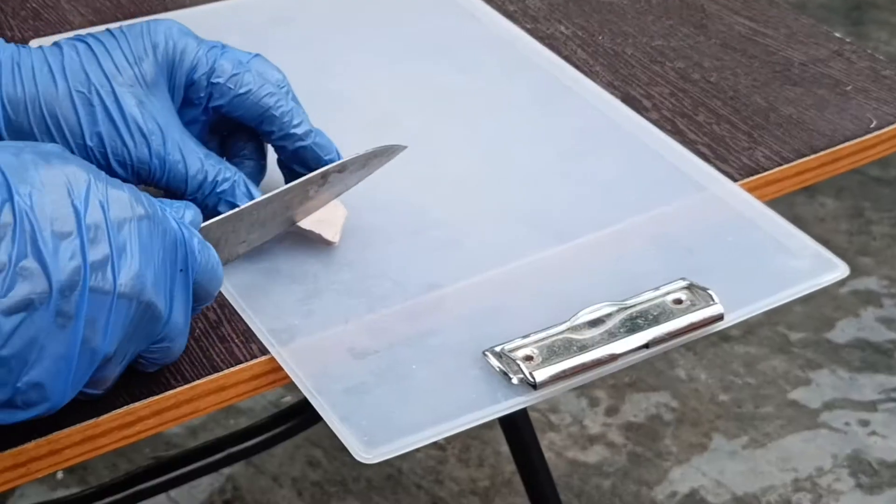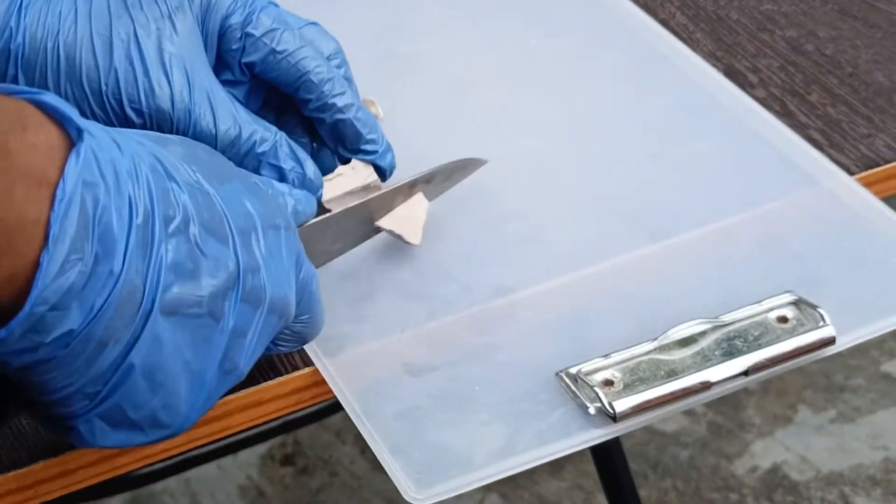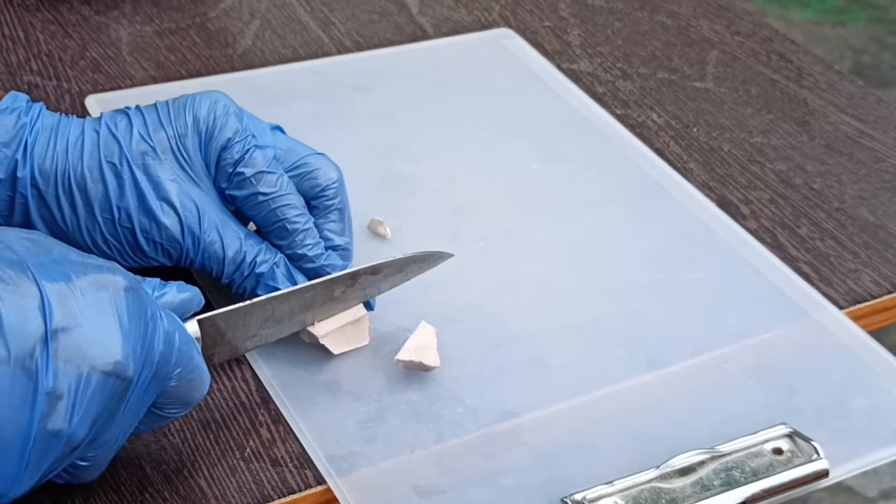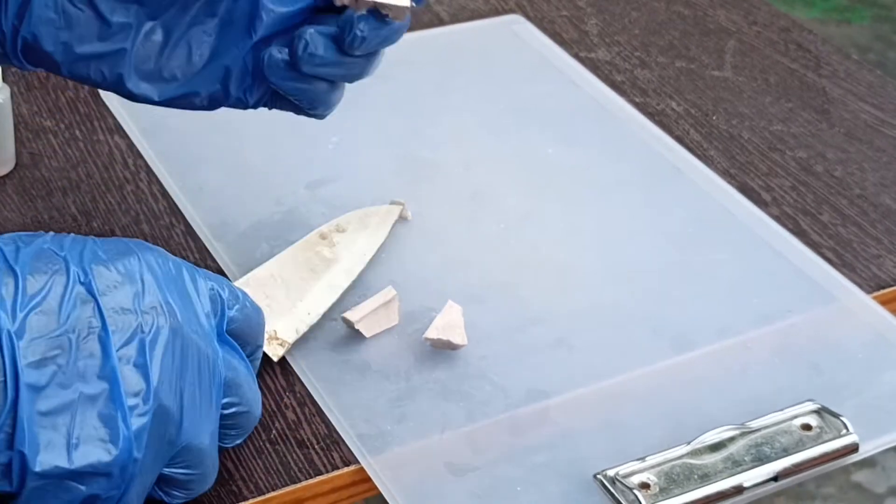The metal usually looks dull because of the oxidation layer on the sodium metal. When you cut it, you can only see the shiny part for a while. It tarnishes so easily.